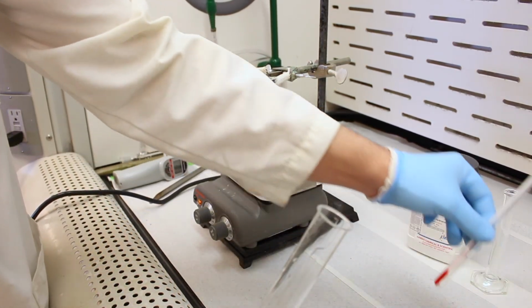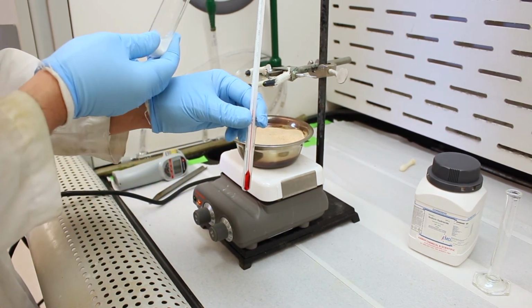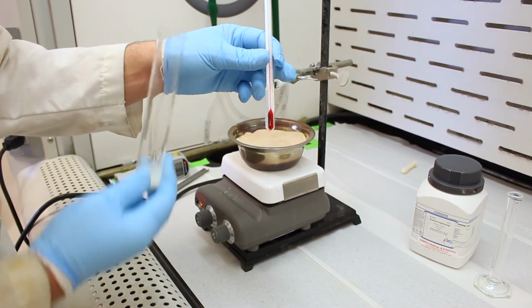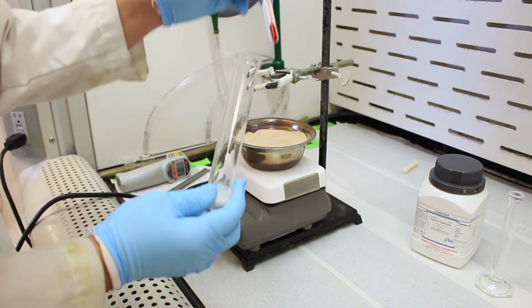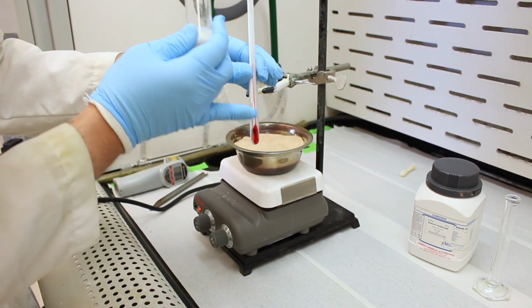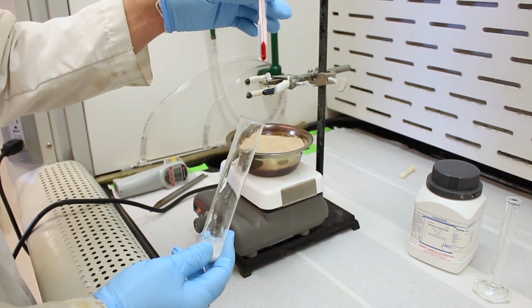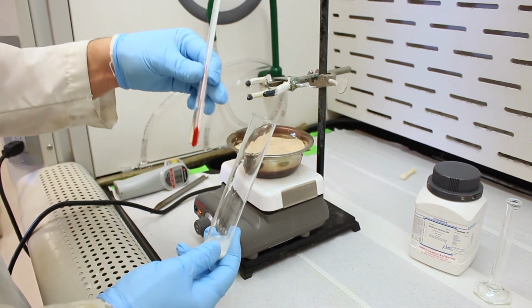To monitor the temperature, we have this apparatus here. This is a thermometer that goes up to 200 C, and it's sitting in a smaller test tube with a little bit of diethylene glycol, and this will sit inside the test tube and measure the temperature. The reason we add the extra test tube is to give it a bit more strength, because we're going to be using this as a de facto stir bar to agitate the solution while it reacts.